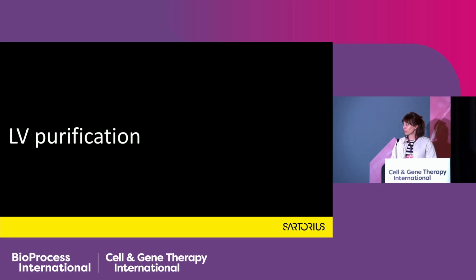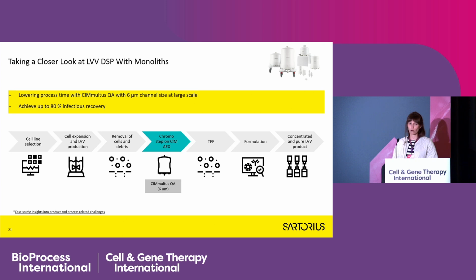And now let's jump to lentivirus purification. This will be more like a case study of how we approach lentivirus purification using monoliths, and how we start a study with an aim to really improve the yield and end with a product with really high infectivity. In this study, we were particularly focused on the chromatographic, purification step, and all the other steps were not in our focus.